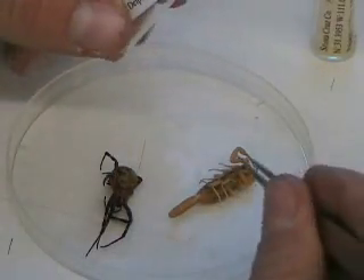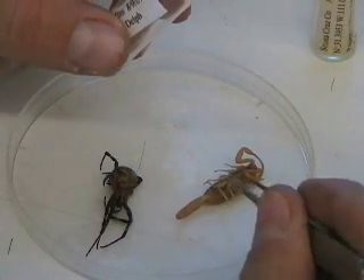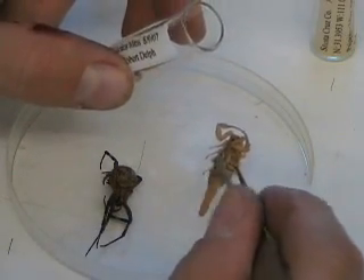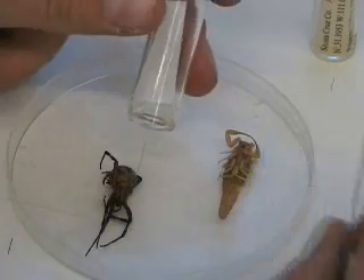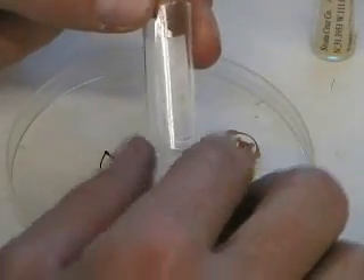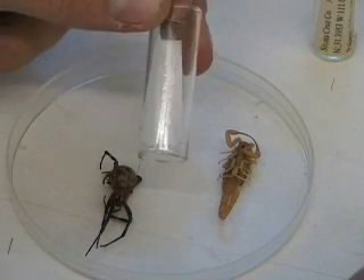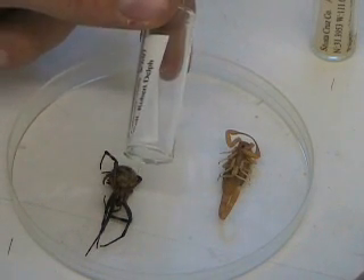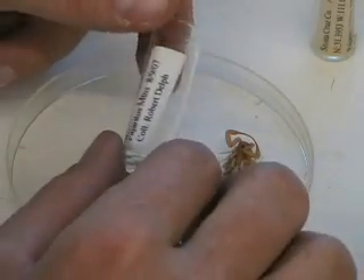Here's a scorpion. This is a bark scorpion, Centruroides exilicauda. I'm going to take the scorpion, and you want to make sure you have a vial that is about equal to the size of the specimen. You don't want to overkill — you don't want a very large vial for a very small specimen. This saves space and money.